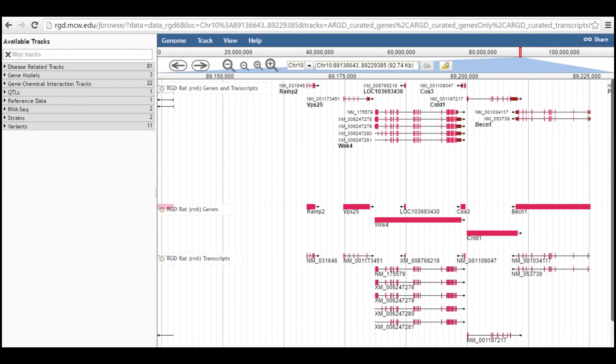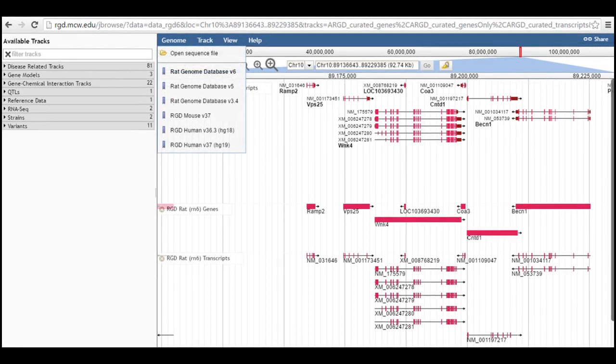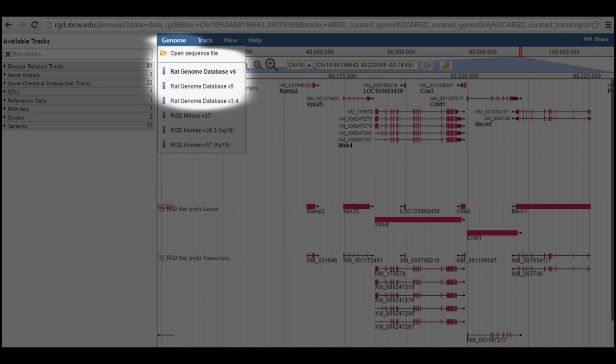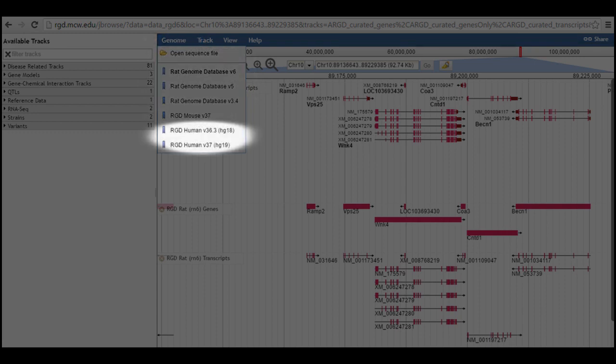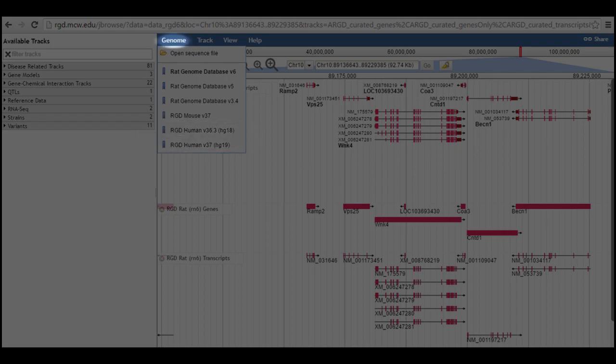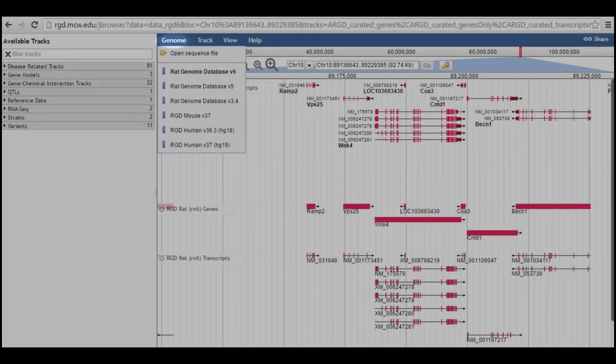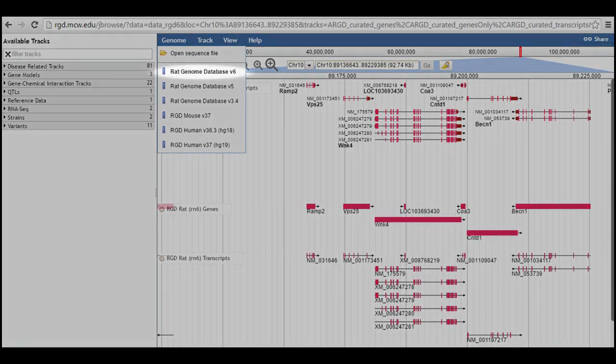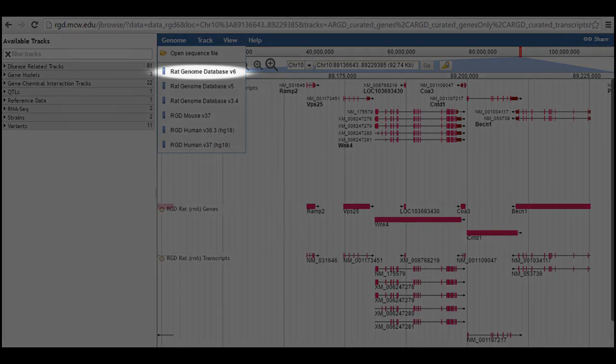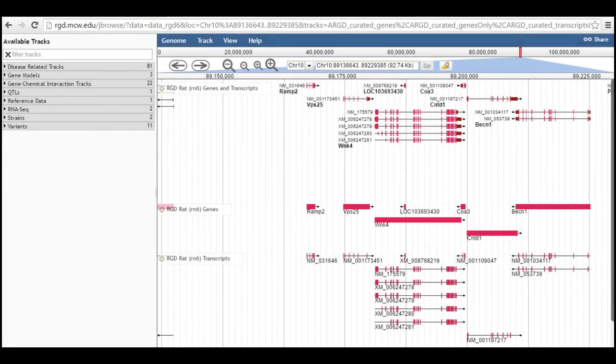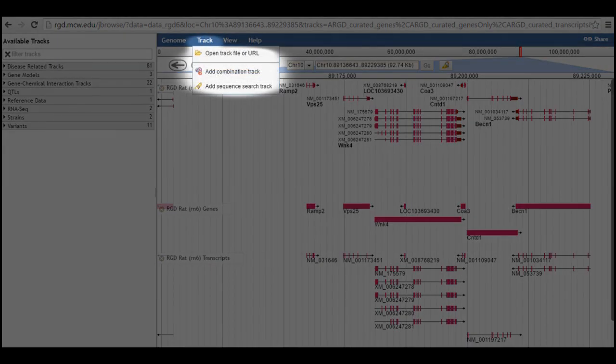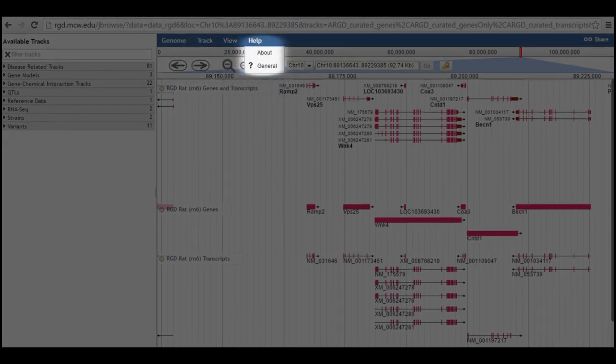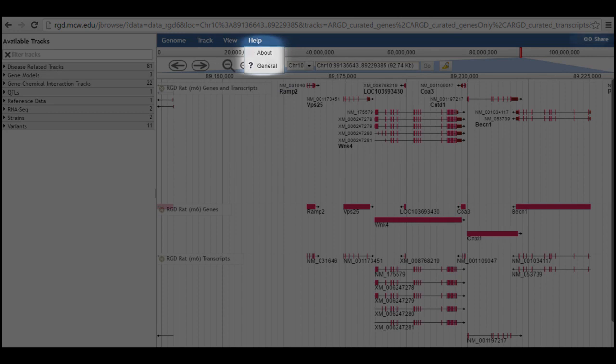Beginning at the top, RGD has versions of JBrowse for the three most recent Genome assemblies for RAT, as well as versions for mouse and human. These are all accessible from the Genome menu at the top of the page. Note that the assembly currently being viewed is indicated by bold text in the list. Other menu items include options for displaying tracked data from external sources, for highlighting regions of the genome, and general information about JBrowse.